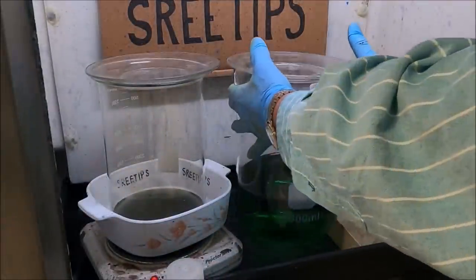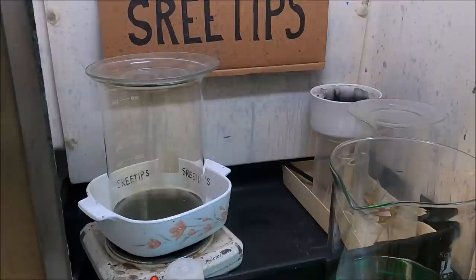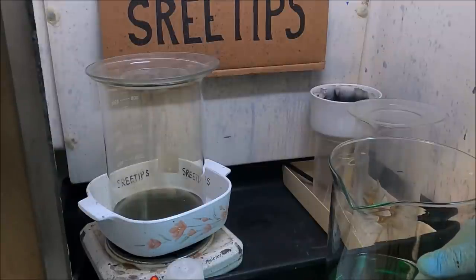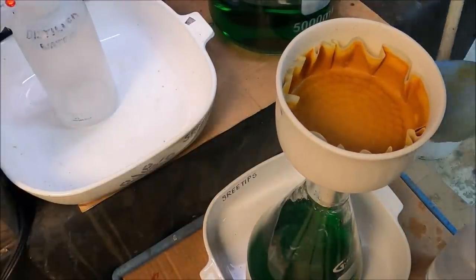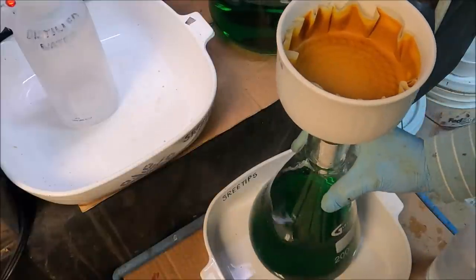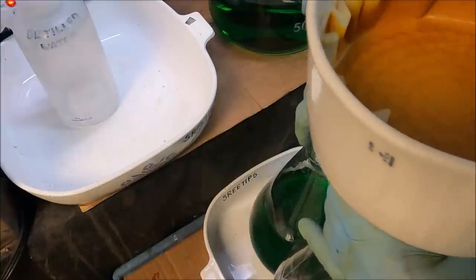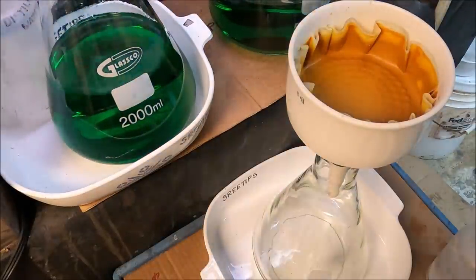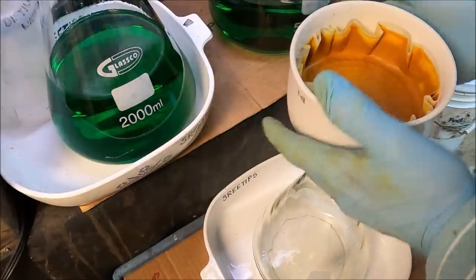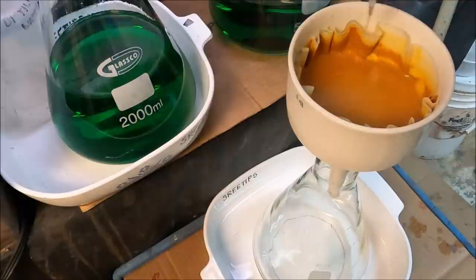Solution up front here. This is our silver solution that probably has a little bit of gold dissolved in it. It's got some excess dimethylglyoxime. I just precipitated out the palladium with the DMG out of this solution, and I'm gonna swap out the flasks here now. Precipitate out here real good because we want to get all the silver out of here.